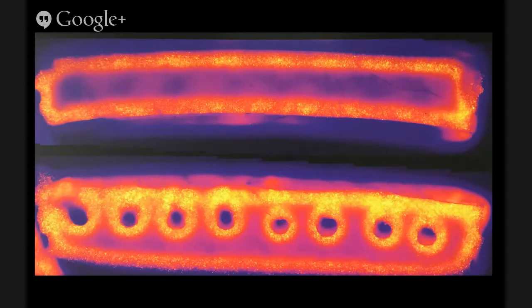So the big thing, as John alluded to, is this notion of vasculature. This is a slab of cells here. We can see these glowing cells on the outside indicate cells that are alive, and then we can see in this slab all the internal cells are dead. If we run just some simple vasculature through that slab, we get a lot more live cells. This is a common thing that you'll see throughout this. Bioprinting is really a means of generating vasculature.